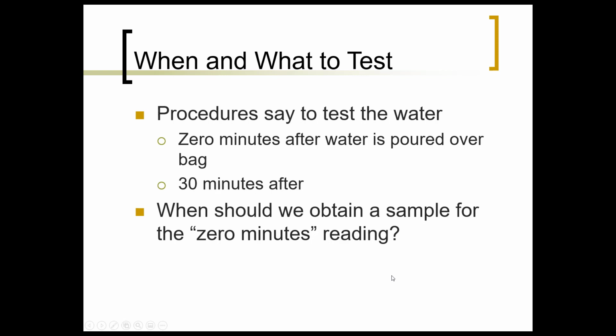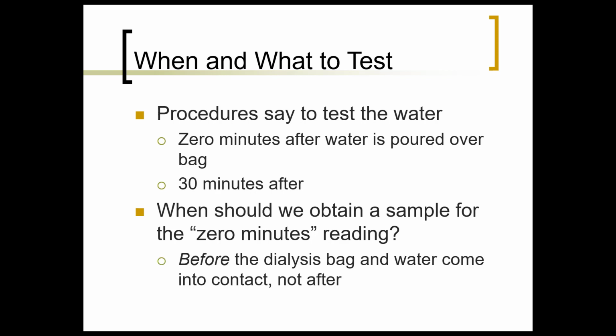We would like to show that the water initially had no solutes in it. Once the water has been in contact with the dialysis bag for any length of time, even as short as 1 second, enough time has passed that some of the solutes may have escaped the dialysis bag. There's really no way that we can obtain a sample without at least 10 seconds having passed, and that cannot be accurately considered to be a 0 seconds or even 0 minutes result.